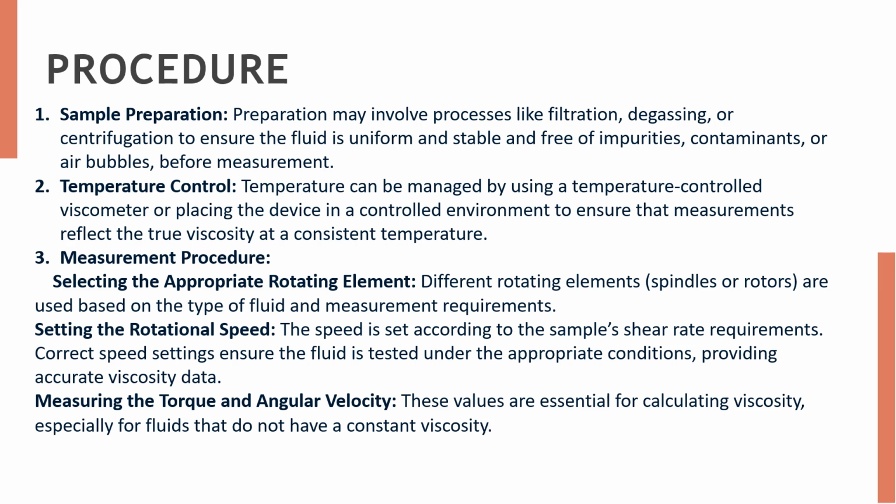Next is the measurement procedure. In that, first we have to select the appropriate rotating element. As I discussed before, rotating elements can be selected based on the type of sample we are using and the measurement requirements. For this, we have to go through the literature which is available for the rotational viscometers and the spindles which we are using. Next, we have to set the rotational speed. The speed is set according to the sample shear rate requirements. Correct speed setting ensures that the fluid is tested under appropriate conditions, providing accurate viscosity data.